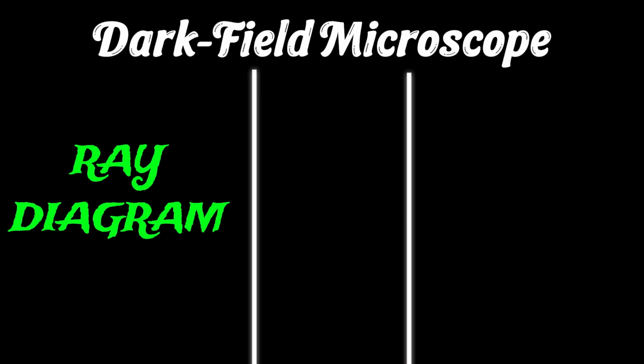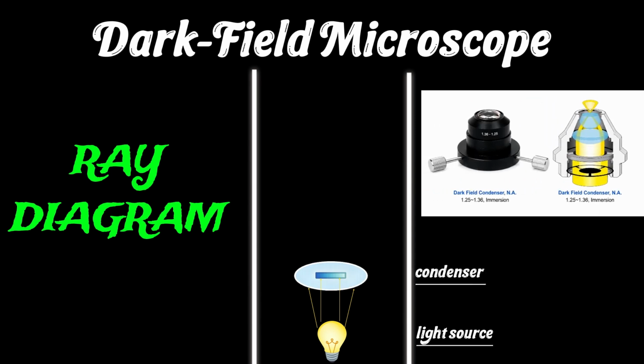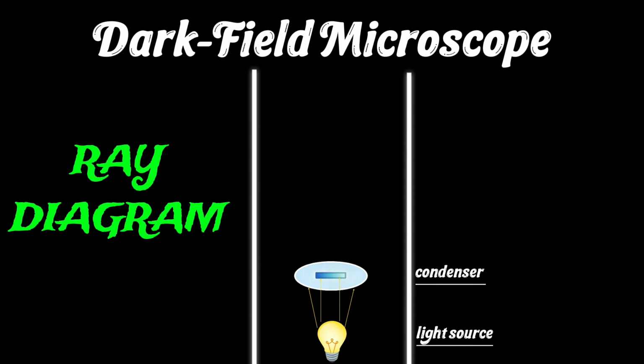Now let's follow the complete ray diagram of the dark field microscope. The process begins with the light source, usually an LED or tungsten lamp, located at the base of the microscope. The light travels upward and enters the dark field condenser. Unlike a bright field condenser, the dark field condenser contains an opaque circular disc, also known as the dark field stop, positioned at its center. This opaque disc blocks the central rays of light and allows only the peripheral rays to pass. The condenser then refracts these peripheral rays, producing a hollow cone of highly oblique light that is focused toward the specimen.